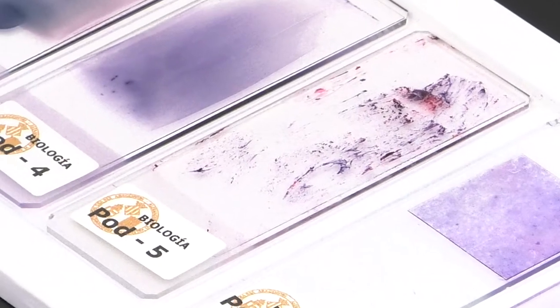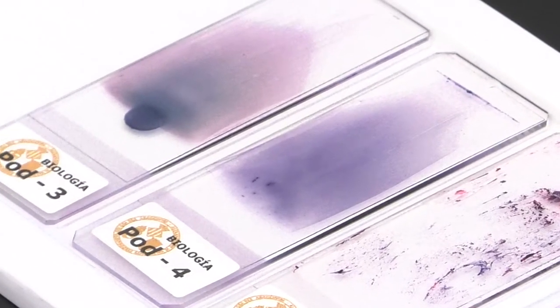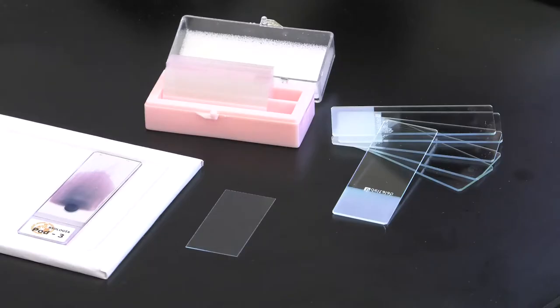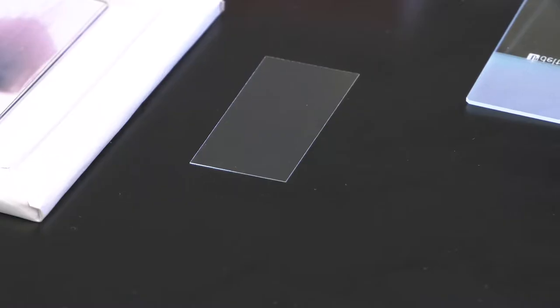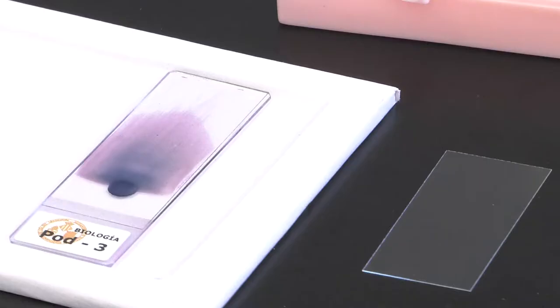Although we can also observe free cells or other objects. The coverslip is a rectangular piece of really thin glass, about 150 microns. It is deposited on the sample, covering it and preserving it from the external agents that could deteriorate it.